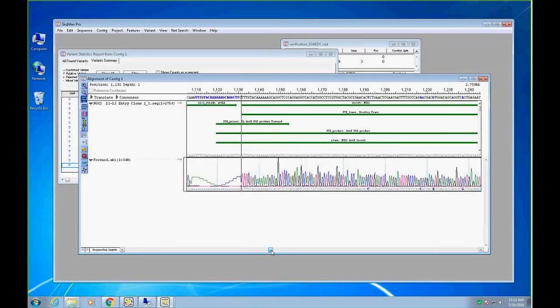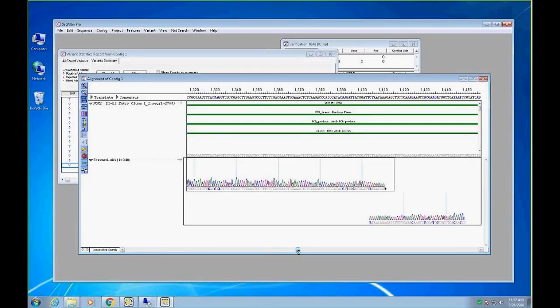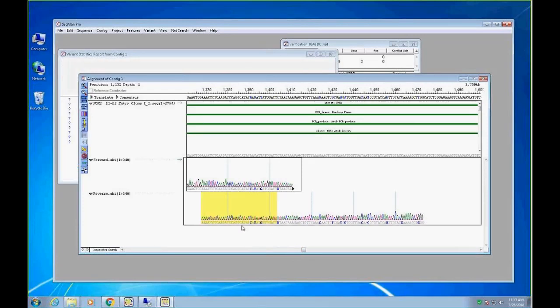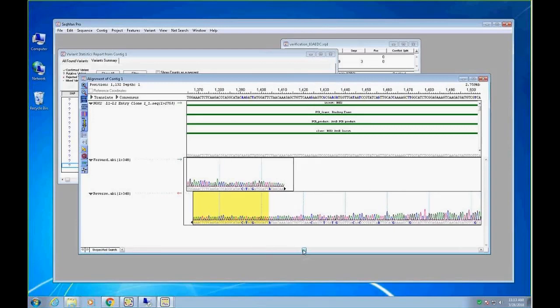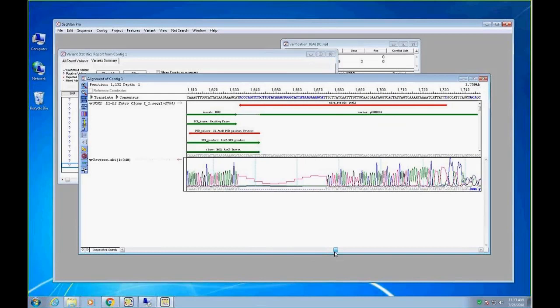I'm going to scroll through now, and you can see different positions in this file that have mismatches. Now here's the reverse read coming in, and I can extend the trimmed end here and see some of the trim. I'm scrolling through, and oh, there's another site here that has a similar pattern. So even though there are lots of variations, they're mostly in a string, and it has to do with differences in the clone. I just selected the wrong clone.